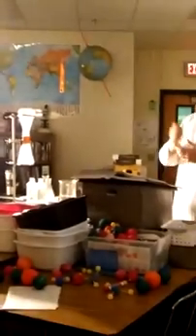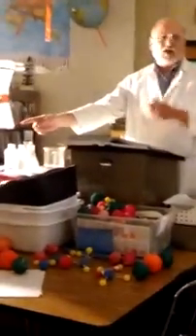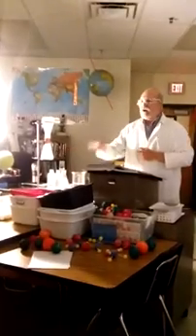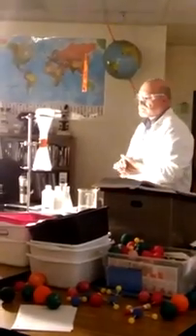And a lot of people, when they see a reaction like this, say, well, the atoms of magnesium have just been destroyed. They're gone. But they're there. They've actually combined with chlorine atoms to produce a soluble salt, magnesium chloride, which just like table salt dissolves in water. You don't know it, but that magnesium chloride salt is dissolving as soon as it forms. Sorry. The bubbles are hydrogen gas.